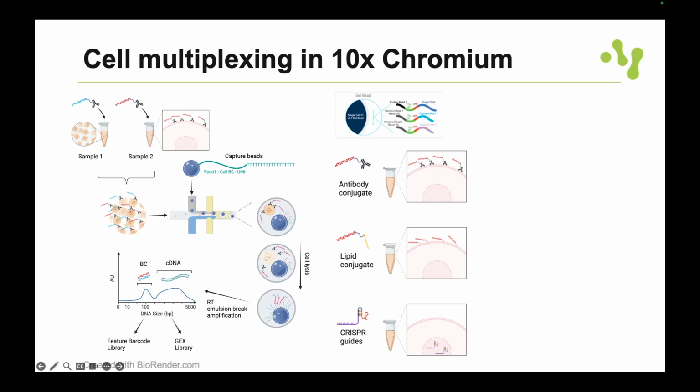No, I think for the antibodies that we can use right now for the multiplexing, because the point here is that if I'm multiplexing, let's say, two different cell types based on some surface markers, because that can also be used, right? If I have a couple of antibodies and each one has a unique UMI for them, then they can be multiplexed together.